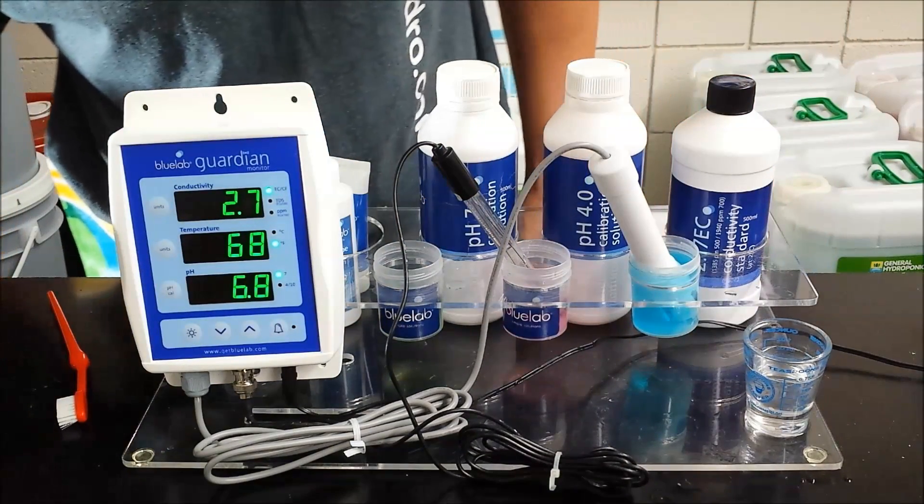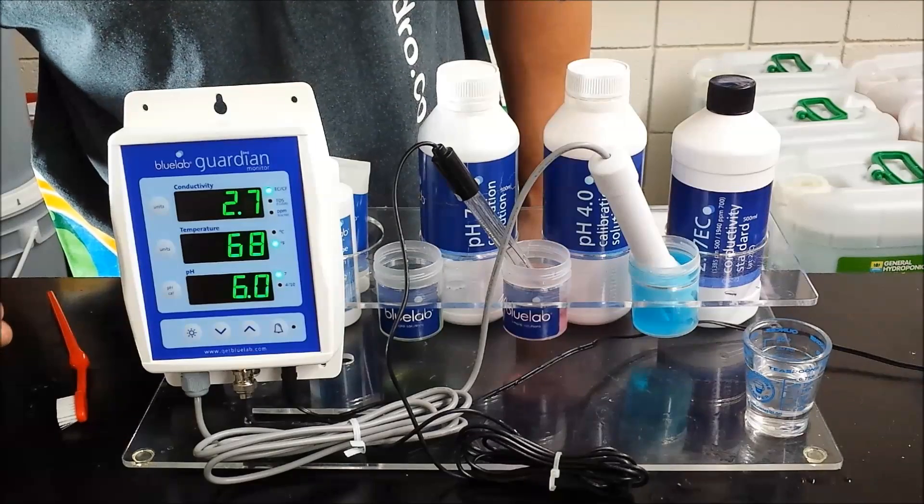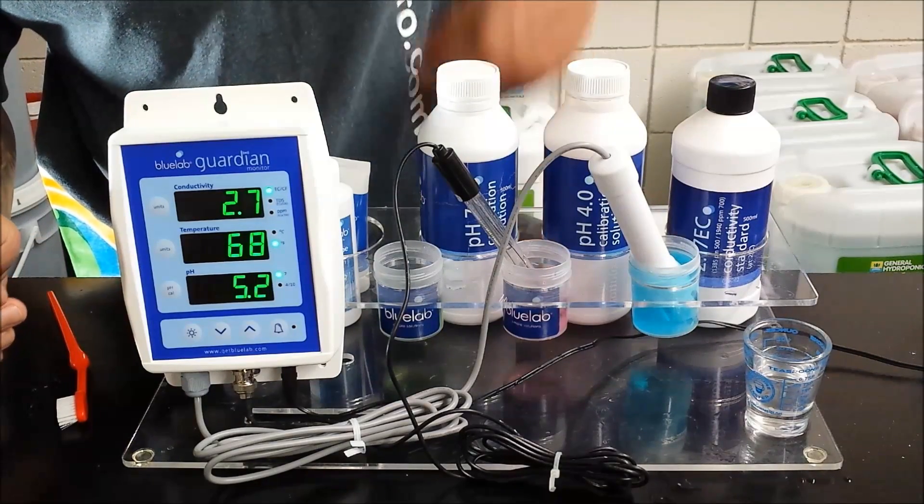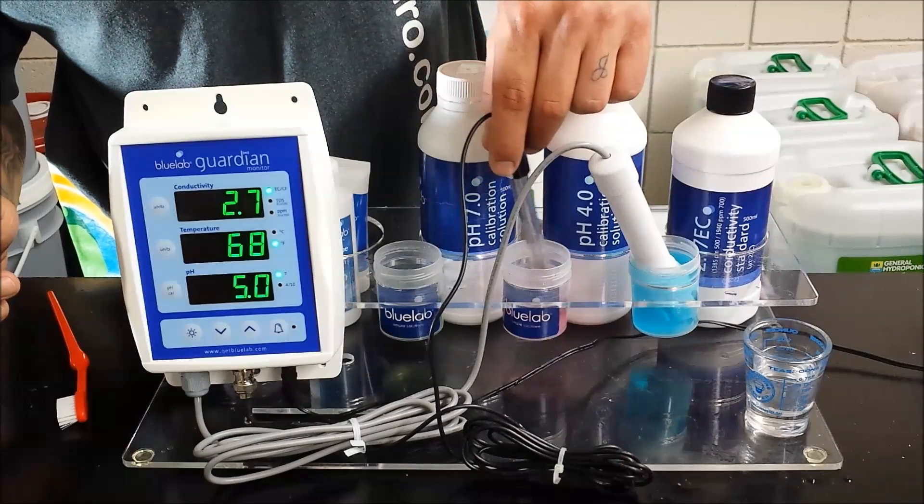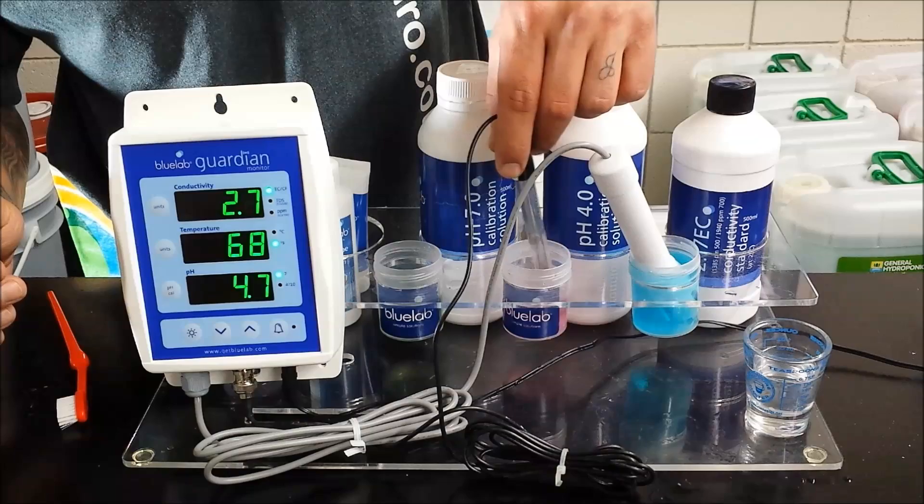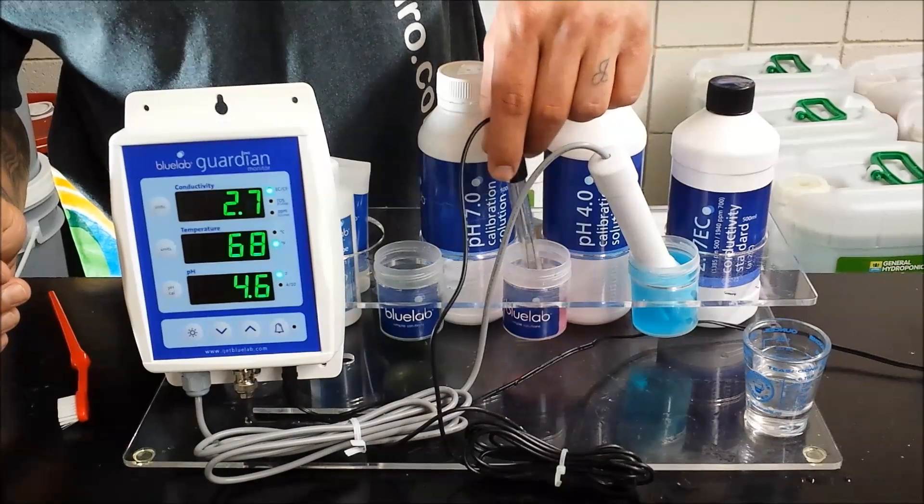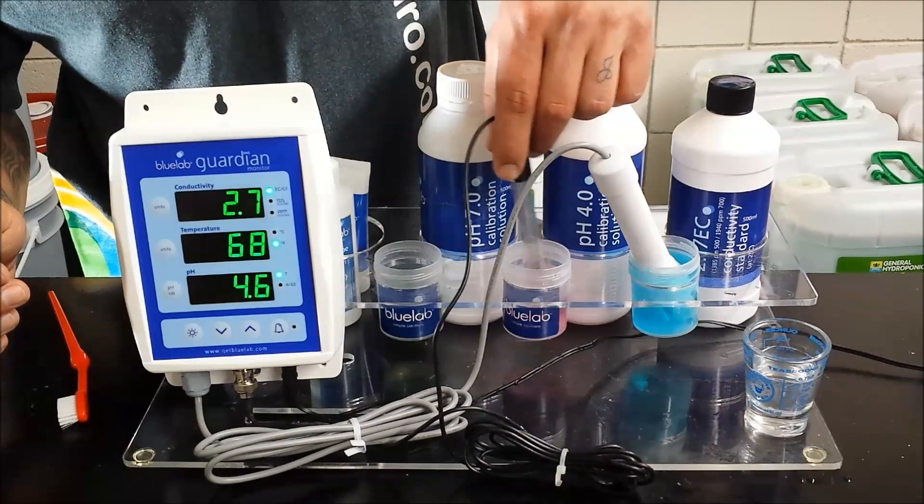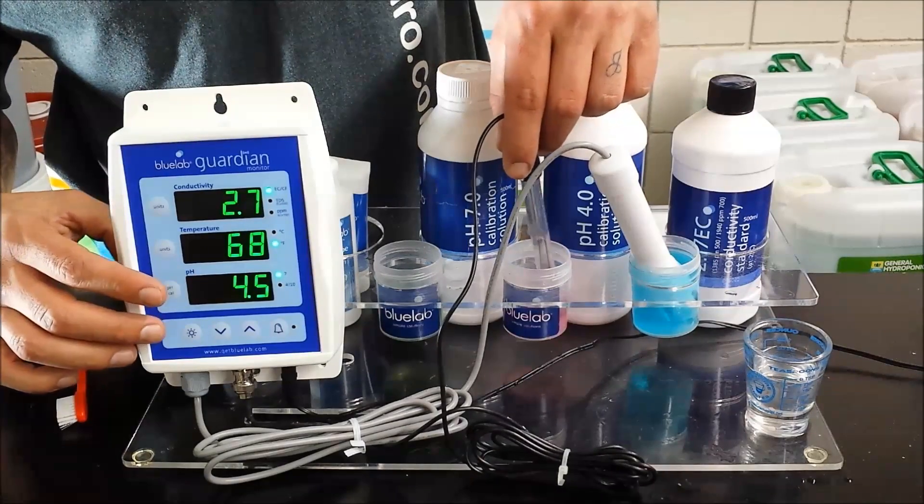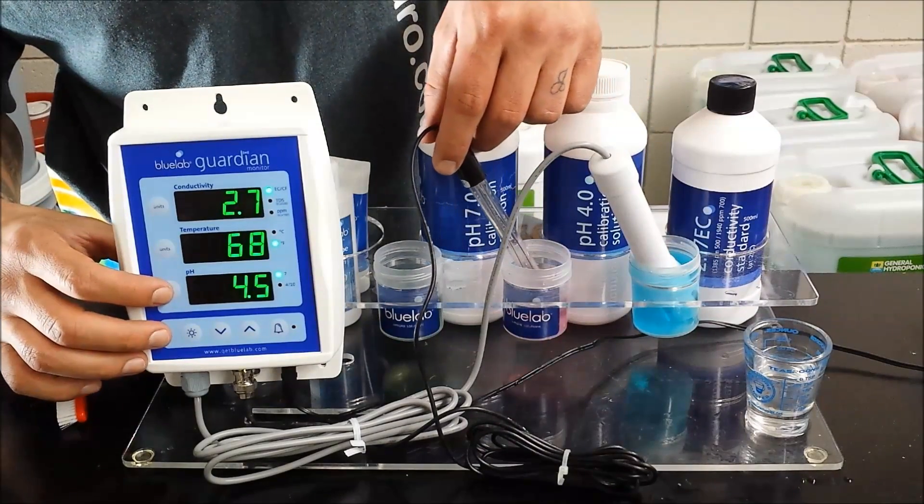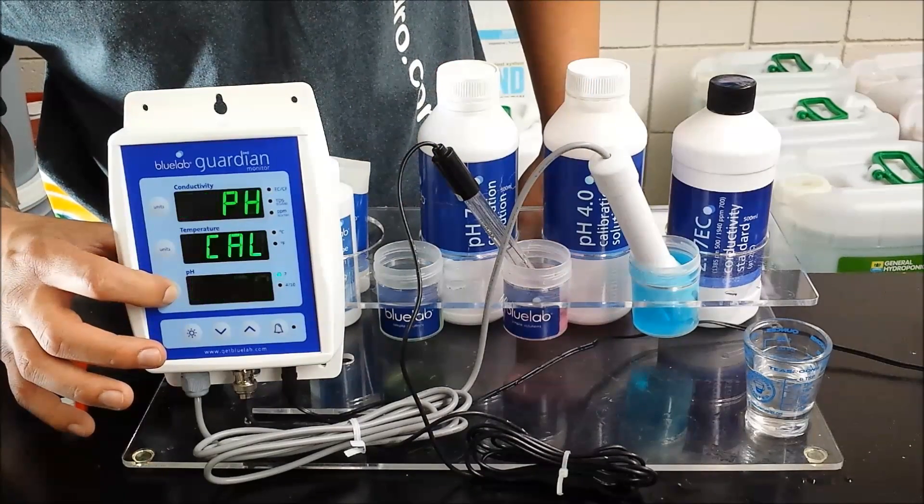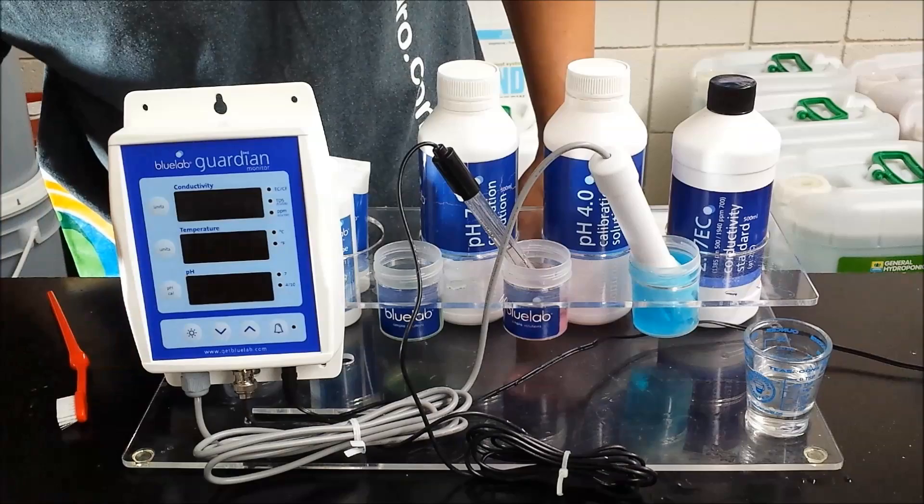Go ahead and put it in the 4.0. Again let it settle on a reading. And then you're going to go ahead and hold the pH Cal button down again, and it's going to lock on to 4 for you.